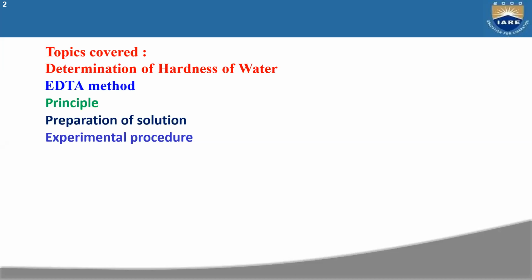Okay, so learning objectives means you will be able to explain the principle of estimation of hardness by EDTA method.